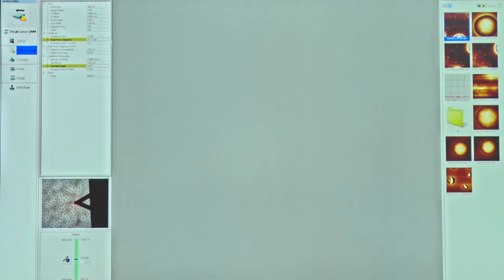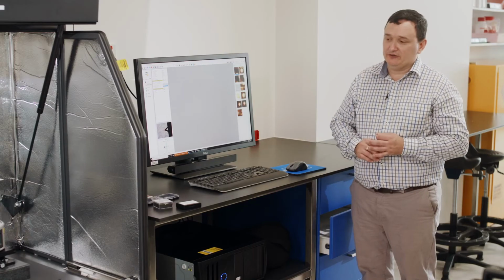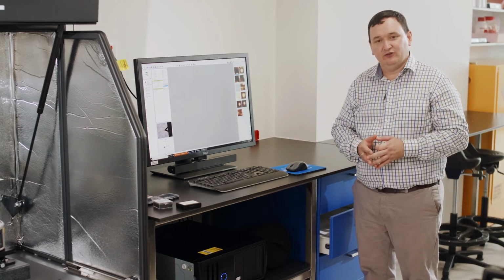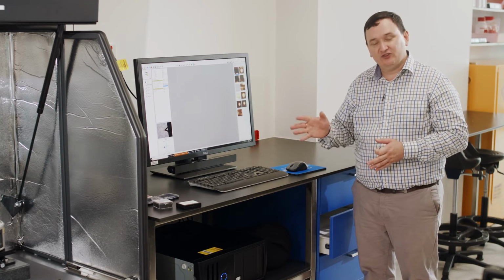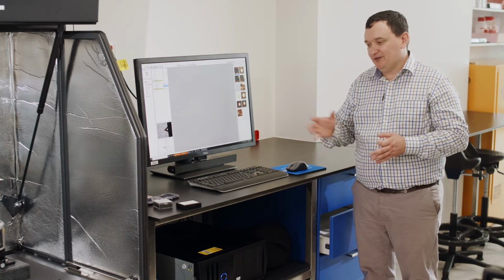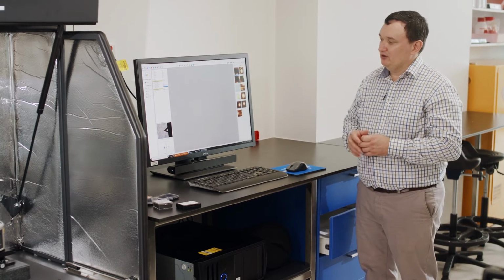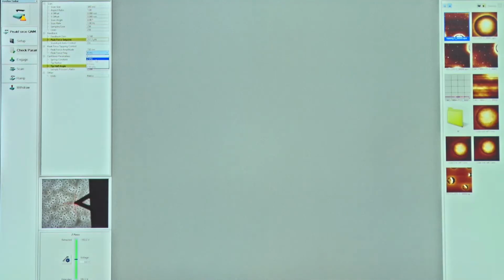We're going to leave everything as default for the moment. I'm just going to change this again back to 2 kilohertz. I recommend for this mode with this particular instrument to run at 2 kilohertz for mechanical properties, or 1 kilohertz if you're using standard stiff polymers, even into maybe some softer metals. The 1 to 2 kilohertz is best. At 4 kilohertz, the measurement won't be quite as accurate, so we prefer to use 2 kilohertz for this particular instrument.